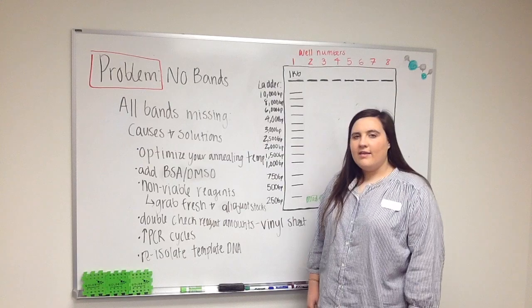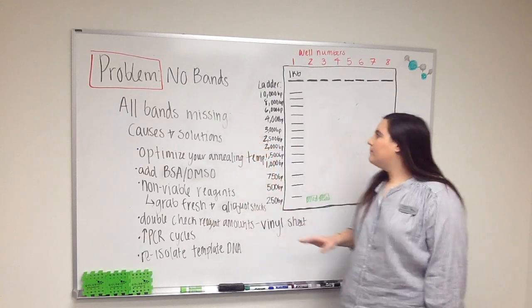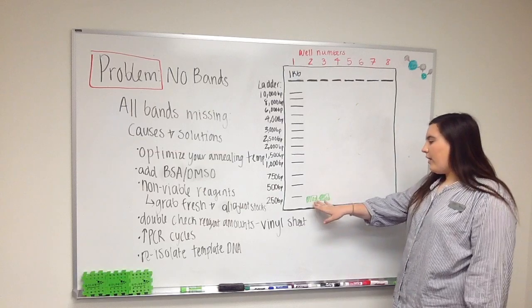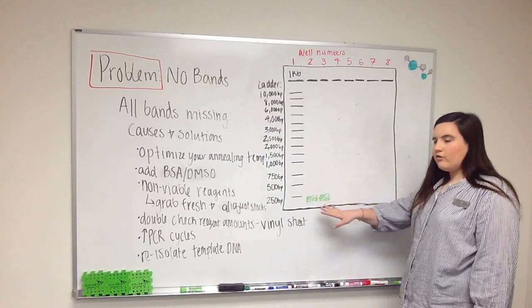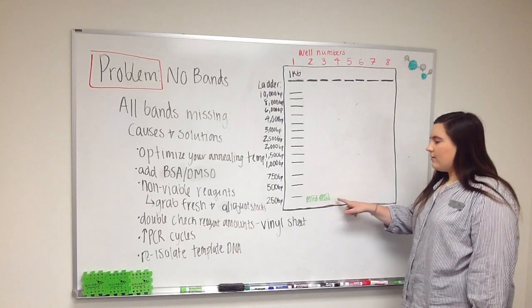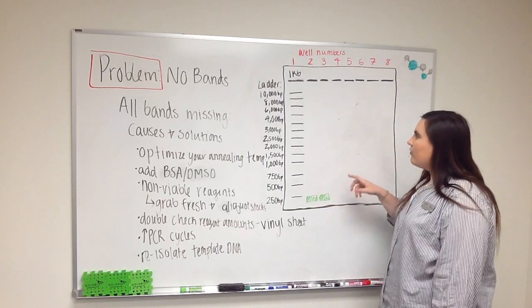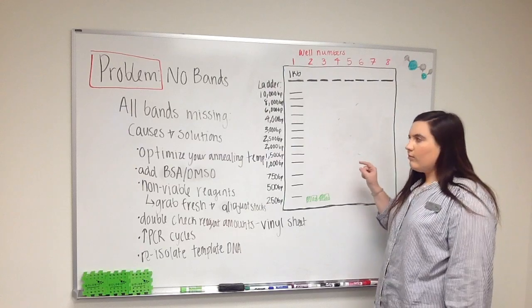The next problem you could be facing is that you didn't get any bands on your gel. Your gel might look something like this where you might have some primer dimers as we discussed earlier towards the bottom of your gel. There are just going to be faint bands at the very bottom. You might also have some DNA fragments scattered throughout, but it's not the bright bands you were looking for.